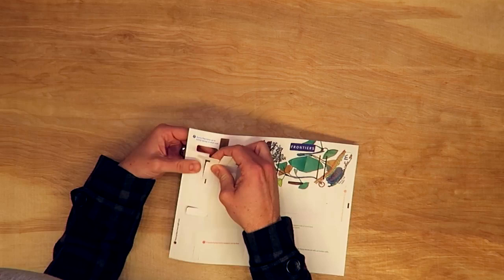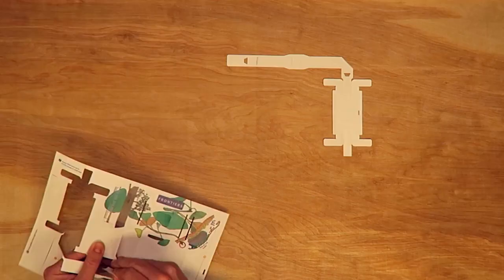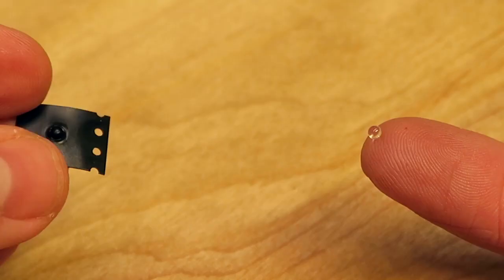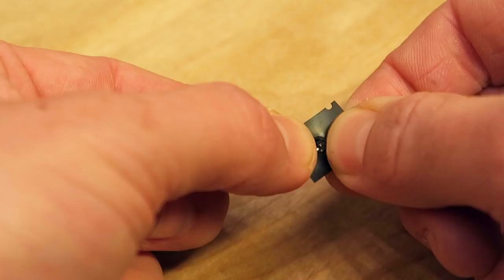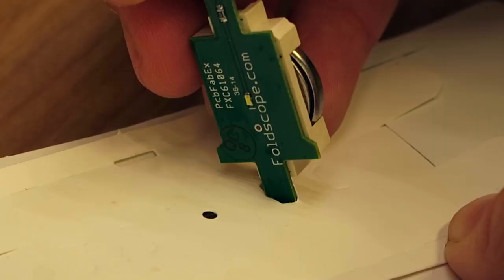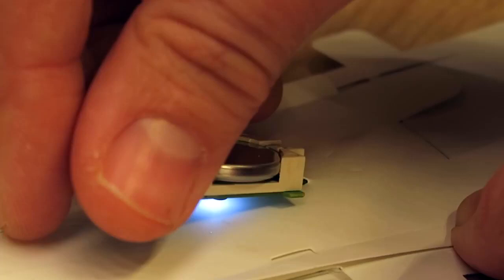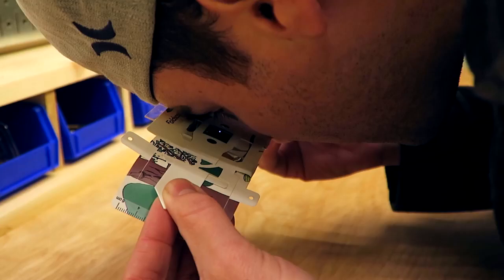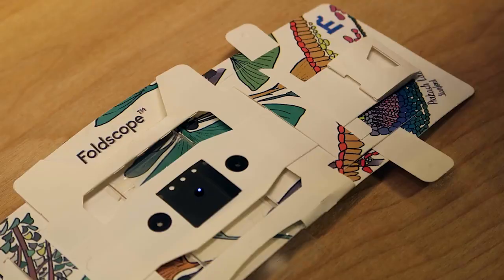So it comes like this, and then you pop out the pieces of paper, and then follow the simple instructions like folding origami. The lens is actually a tiny sphere of glass embedded in this plastic. You can put your slide in here, and then you look through that tiny glass sphere, and it's magnified 140 times. You can even put your phone up to it, and film, and capture video like this.